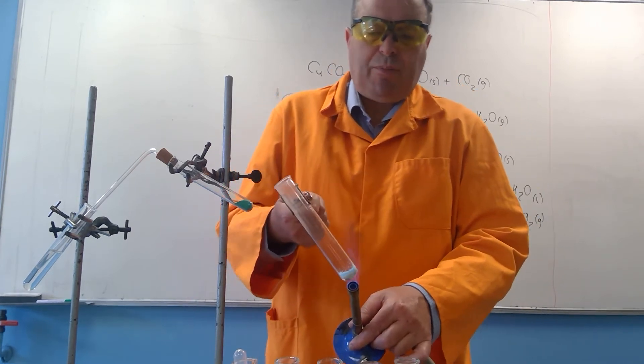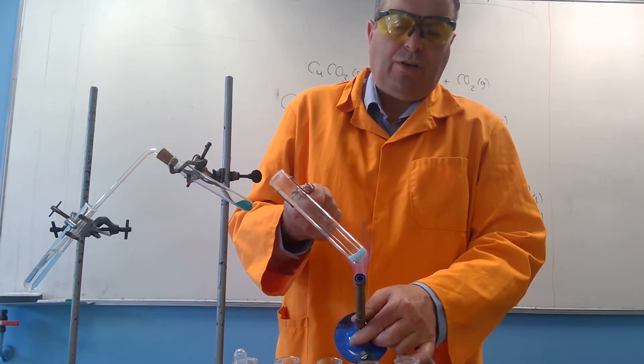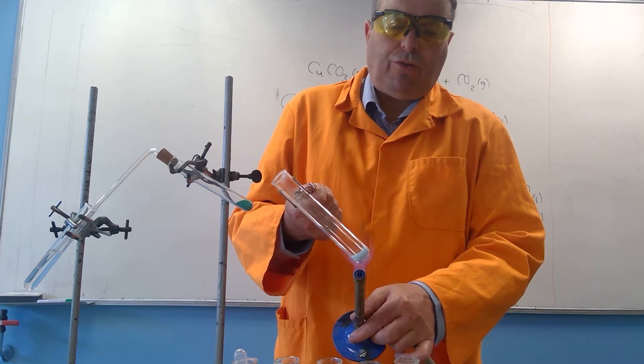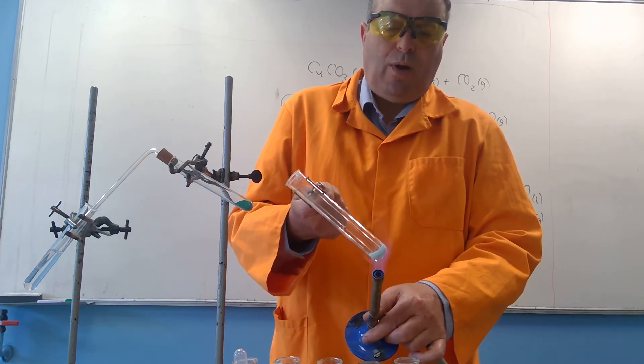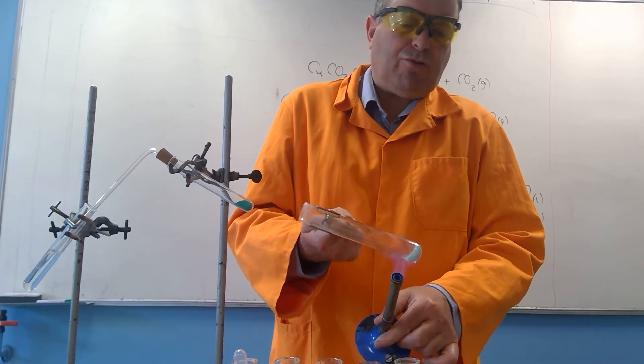So this experiment demonstrates the fact that a copper-containing compound, CuSO4·5H2O, when heated will change color—one of the indicators of a chemical reaction.